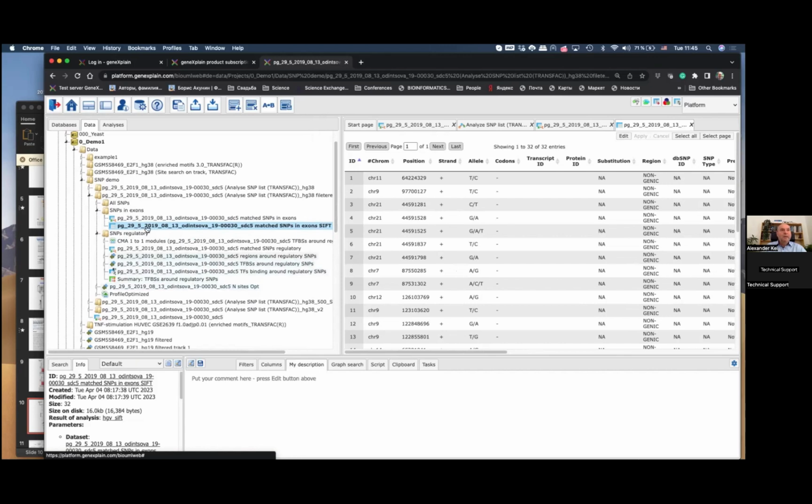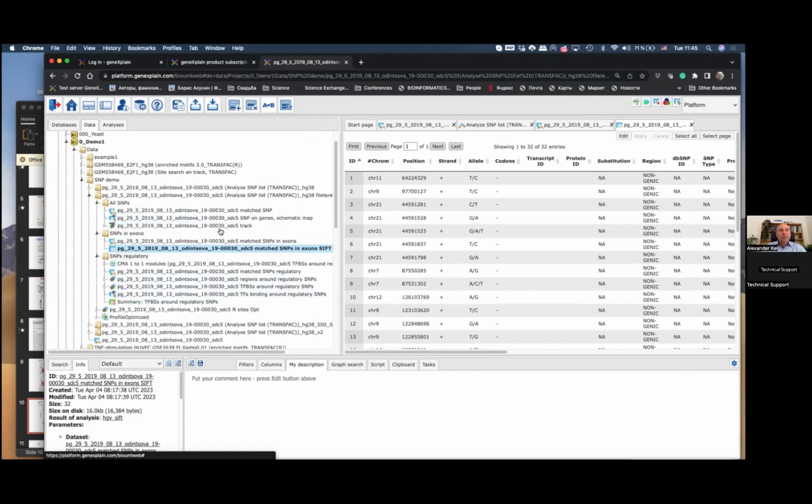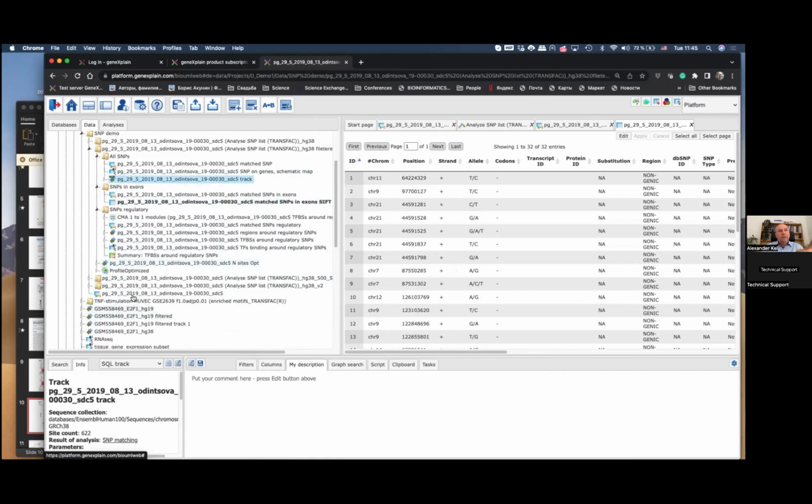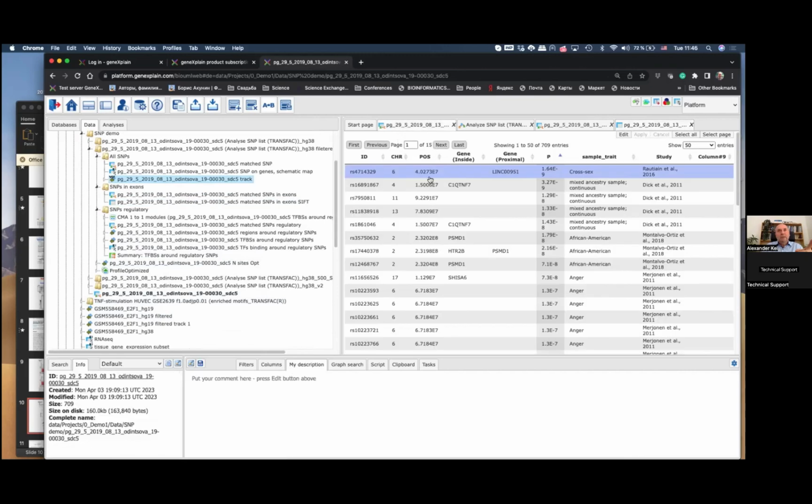First, actually, let's put those SNPs on a genome track. You know, we started from this table of the SNPs, just based on the SNP accession numbers. But the first thing the pipeline is doing, it converts them into a VCF track.